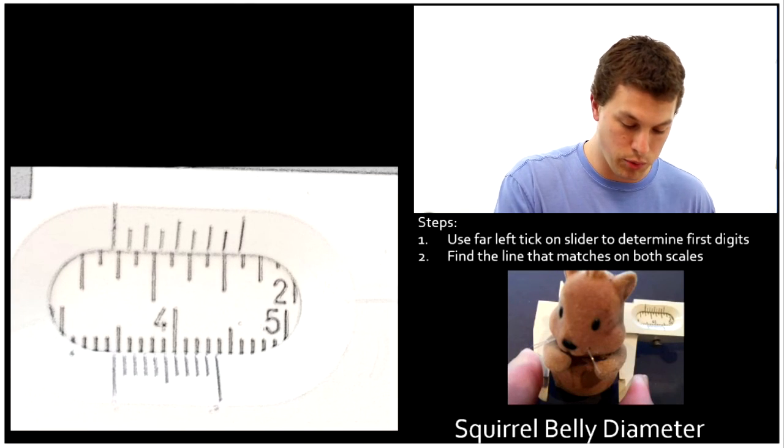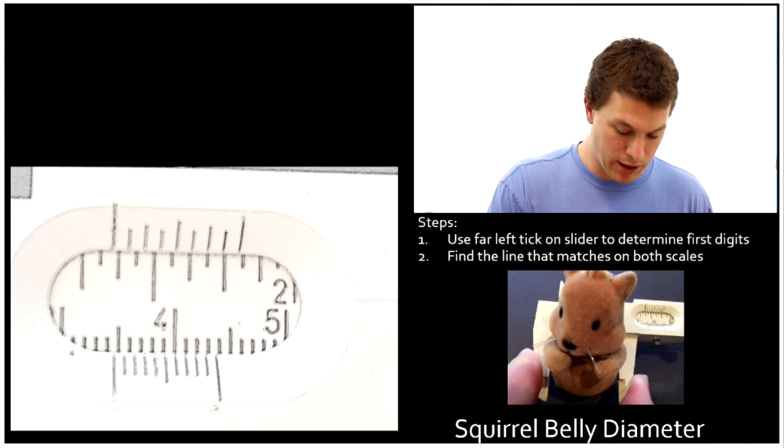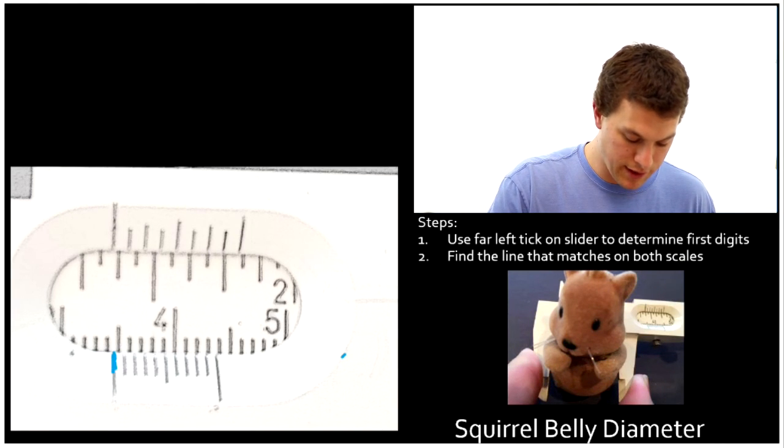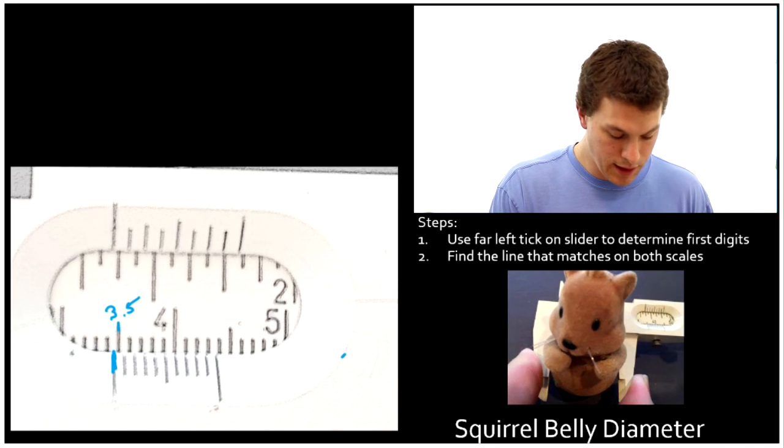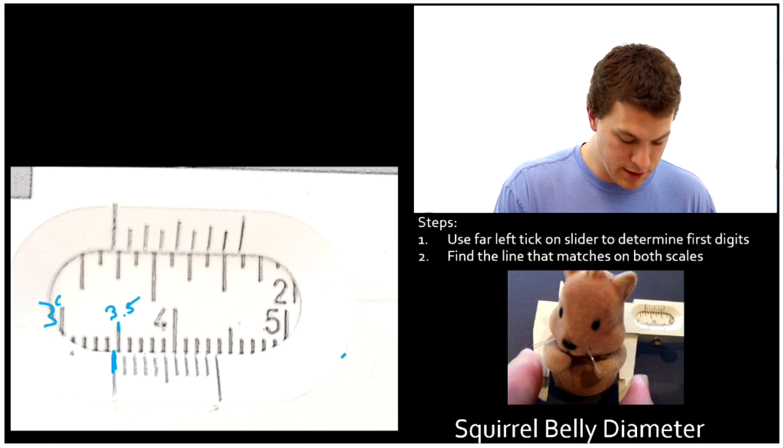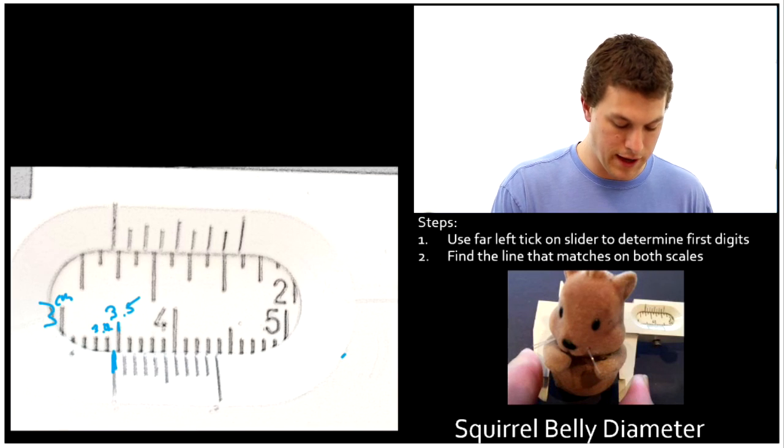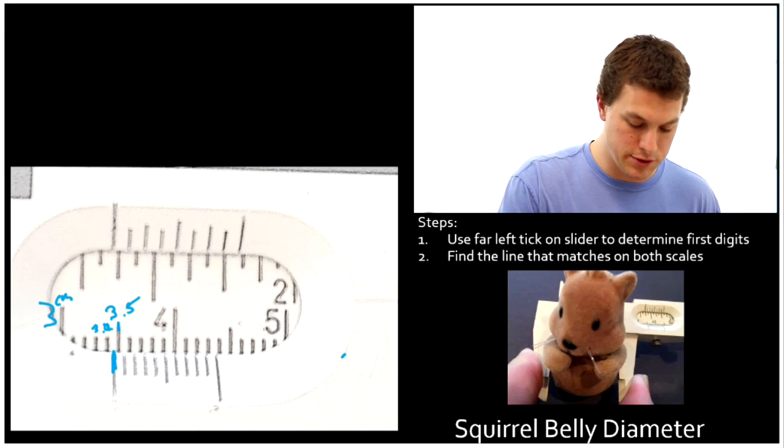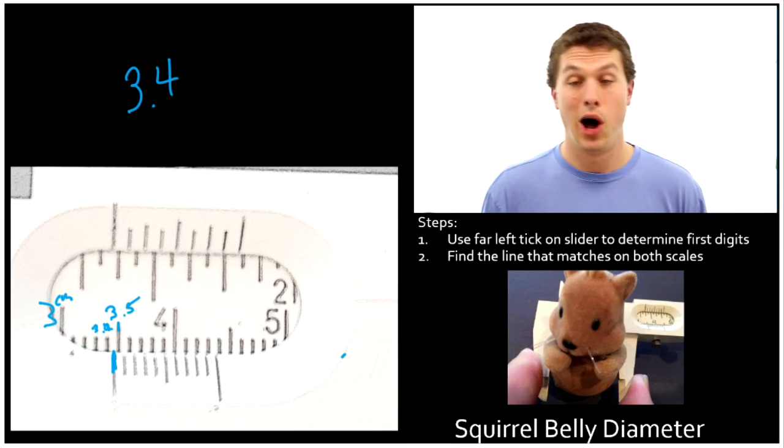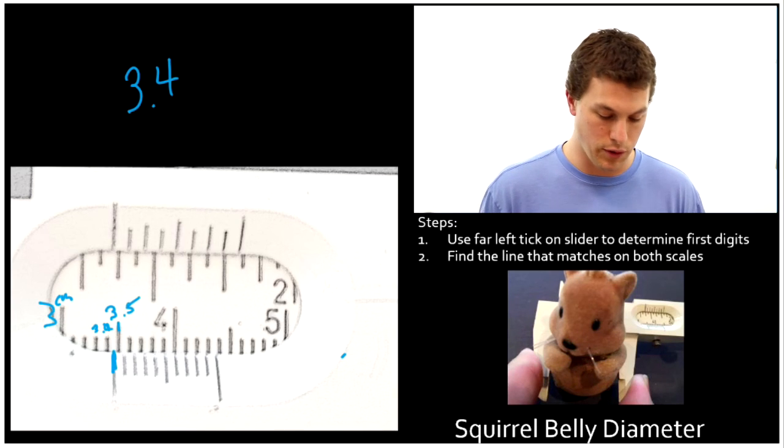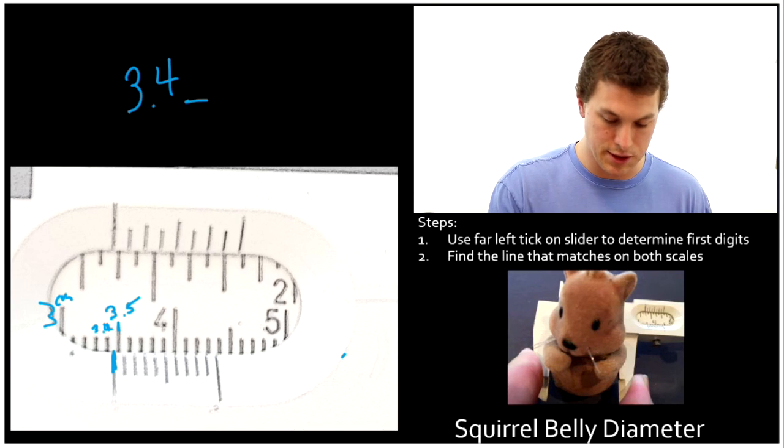Now we've got our squirrel belly, super important stuff here. Again, we're going to look at the leftmost tick and see where it lines up. That would be my 3.5 tick right here, this big guy. And I know that secretly 3 centimeters is hidden over here. So that's falling between 3.4 and 3.5. That means my first two digits are 3.4 because it's taller than 3.4, bigger than 3.4. And we need to figure out this last digit.